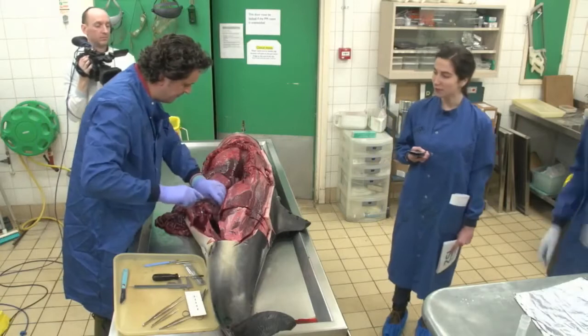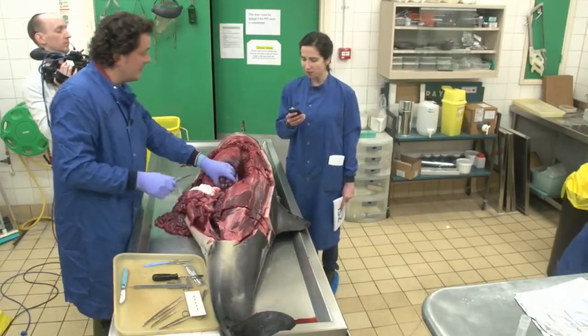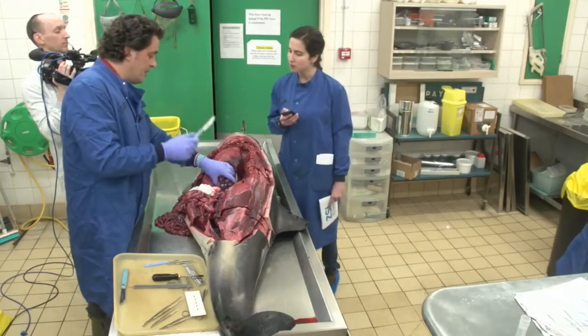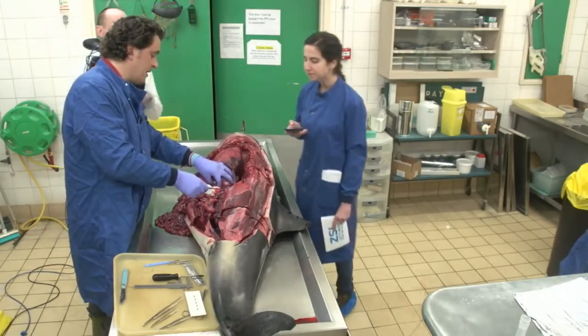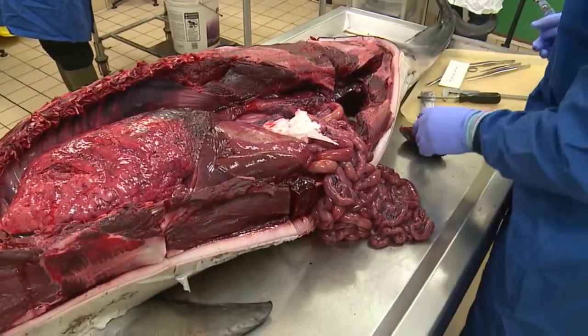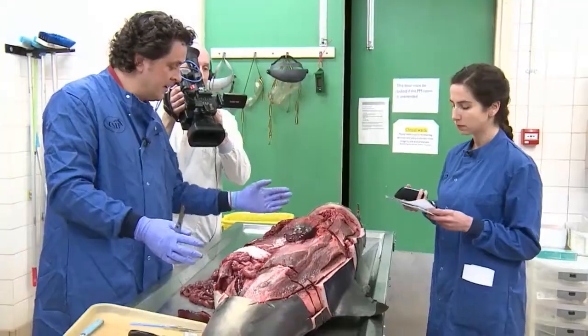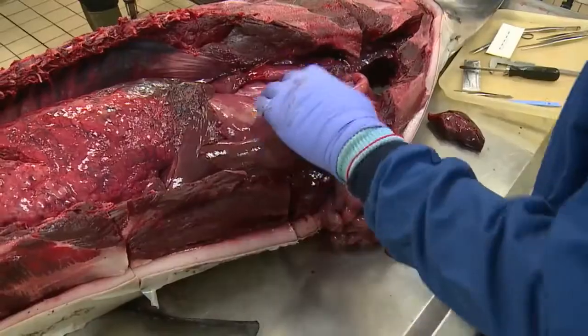Fantastic. Okay. Well, we've got a few more questions coming in. So Rob, I don't know if you want to carry on as I ask you these, or if there's something you wanted to point out first. Before we do, what I'm doing now is taking out each organ system one by one, and we'll go through each one, looking at abnormalities. And I'm taking out the gastrointestinal tract, which is the stomach back to the rectum.